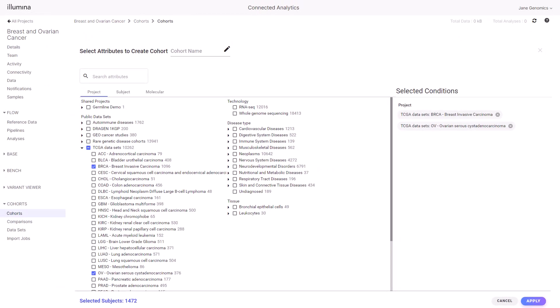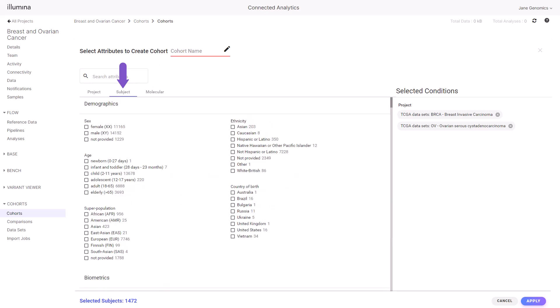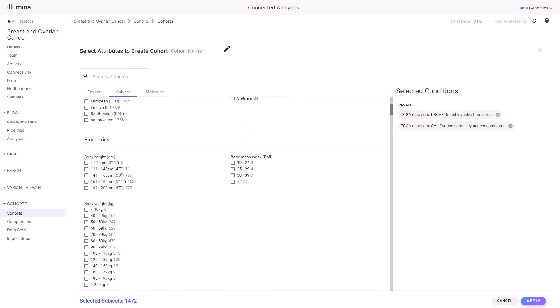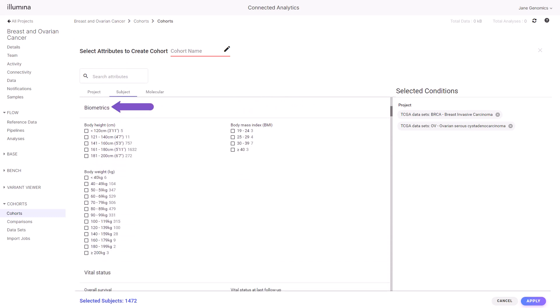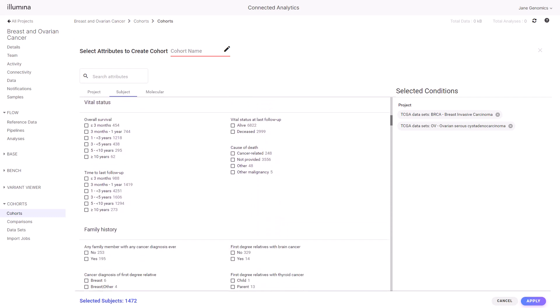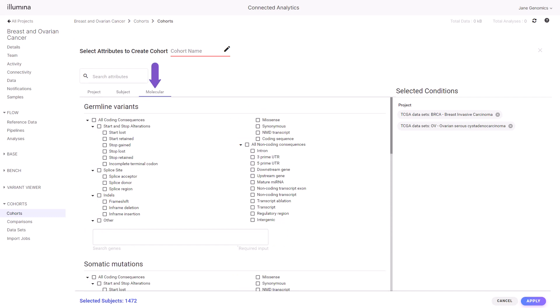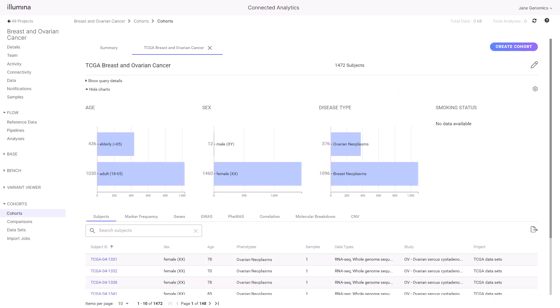The subject and molecular tabs allow for the creation of cohorts using subject attributes like demographics, biometrics, and vital status, as well as cohorts by presence of OMIC data measurements. The cohort is created with customizable charts displayed.